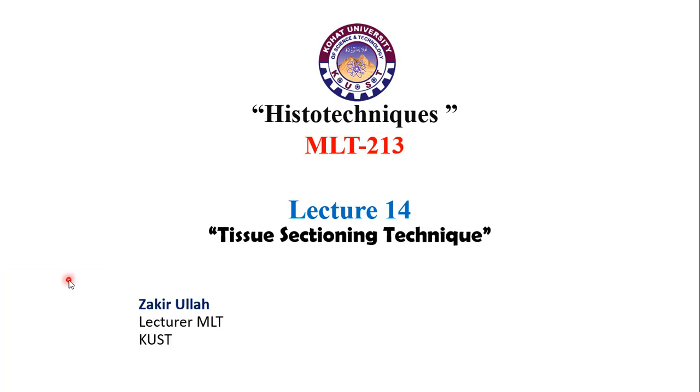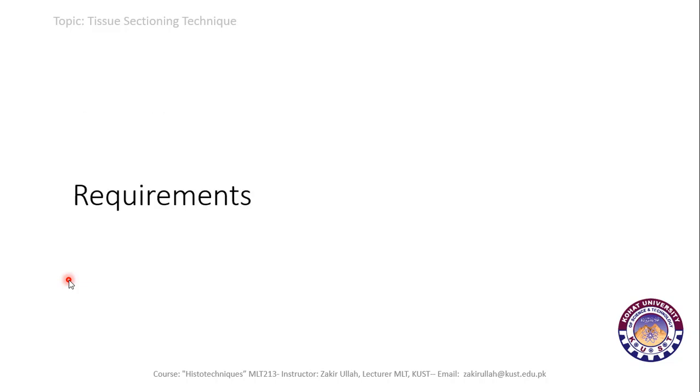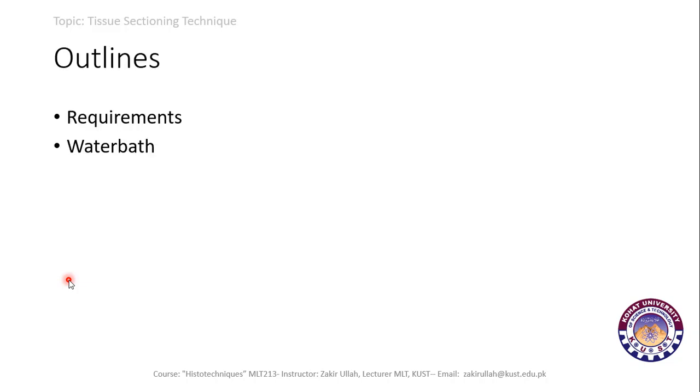This is the lecture about the next step in the histopathology laboratory and histotechniques: how the tissue sectioning technique is performed. In this lecture we will learn about the requirements of tissue sectioning, and the different instruments used in tissue sectioning, that is the water bath, and the related instruments will be discussed.